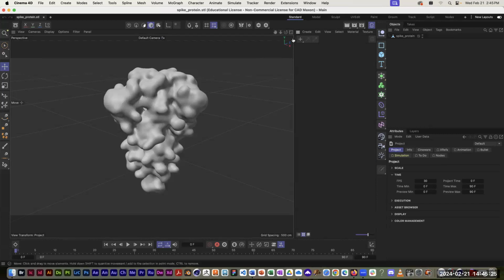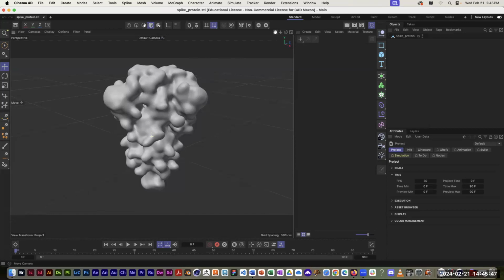Just to the upper right of the 3D image window or the camera window, we have that little hand, the move camera, the scale thing that looks like an arrow coming towards us and an arrow going away from us. That's a scale camera. And we have the orbit camera. One way to navigate around in here is to click on that hand and click and drag.